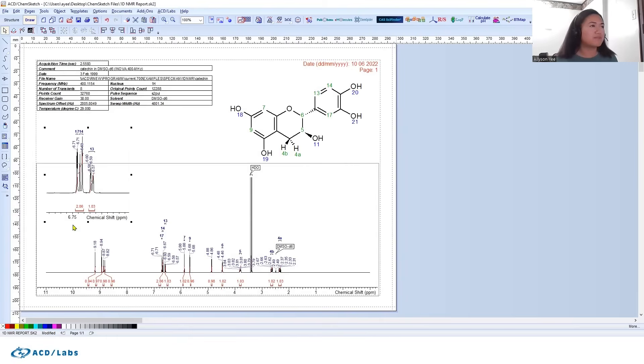I can do that one more time - if I click the Zoom Spectra, let's say I want to zoom in on this multiplet right here. I can just go through that, I'll click right here, I can now resize it, and you'll see that all of the information is kept within these zoomed inserts.